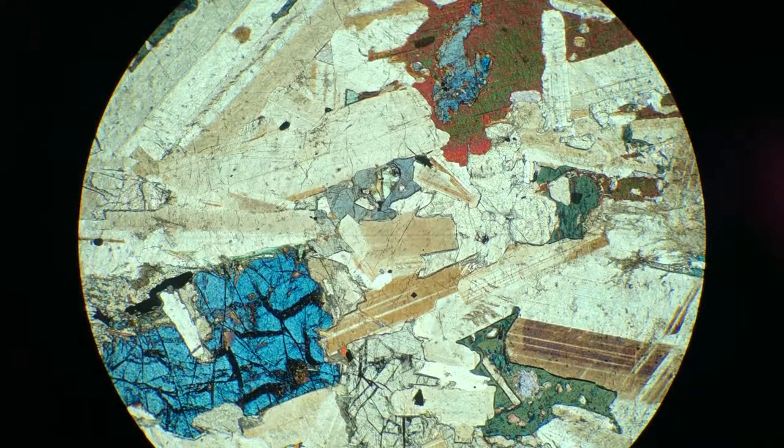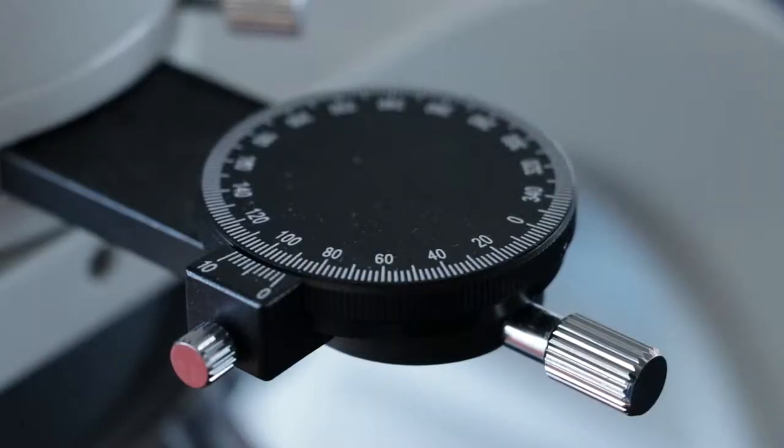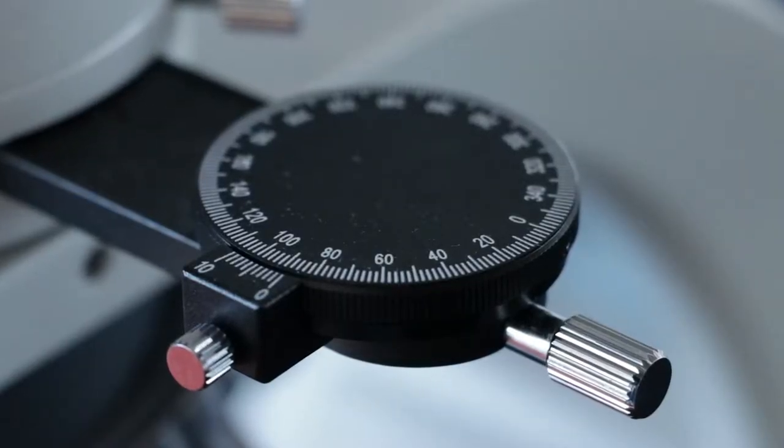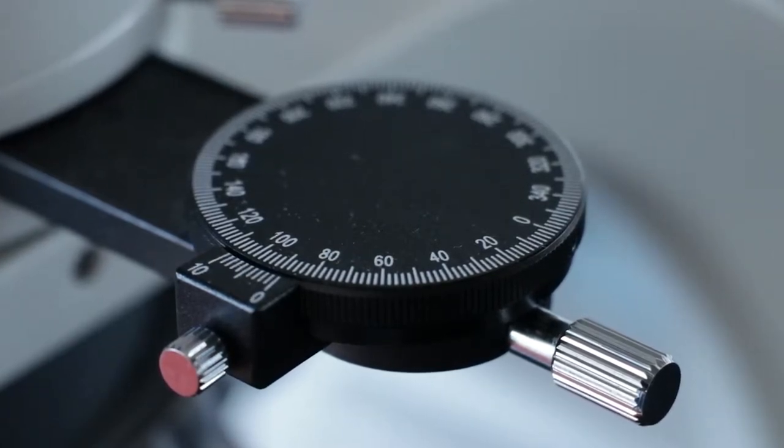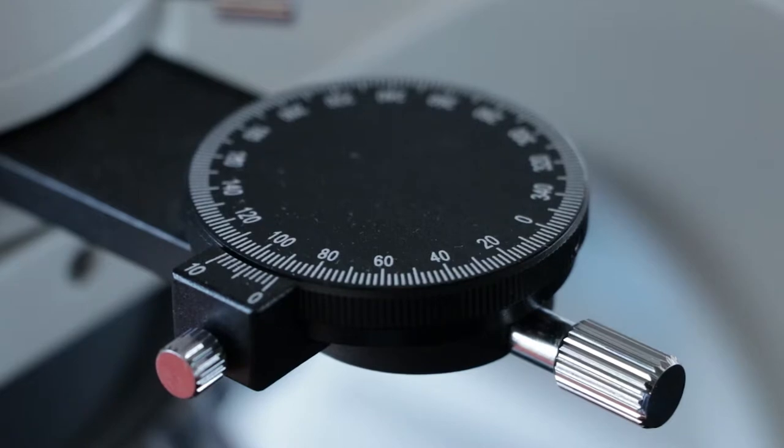If you notice plagioclase with such atypical interference colors, then this is a very good indicator that something is not adjusted right on the microscope, and you should ask the instructor, TA, or lab technician for help.